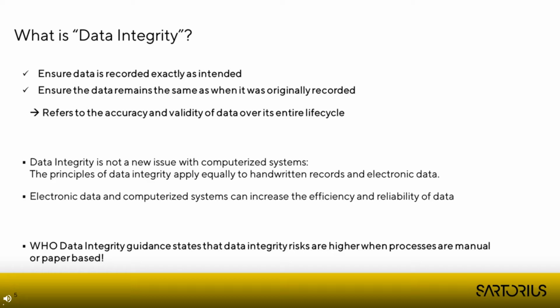And these principles of data integrity don't come up with computerized systems. We have to follow the same principles also when we work with handwritten records. But what we will see in the next slide is that when we work electronically and with computerized systems, we can increase the efficiency and the reliability of our data.